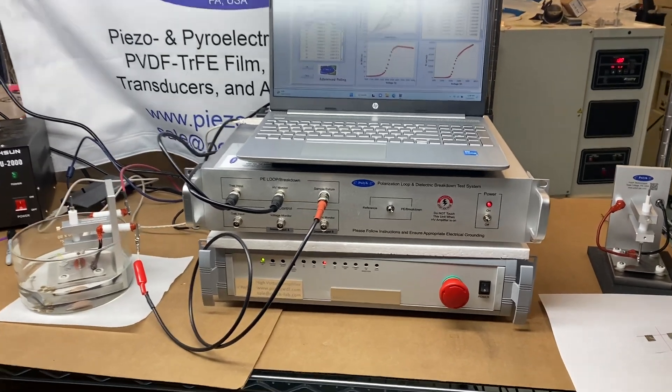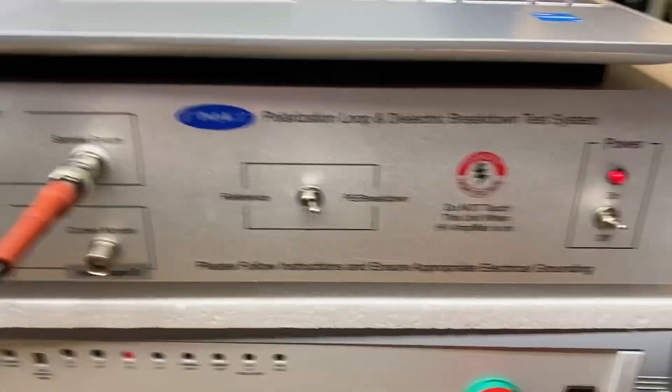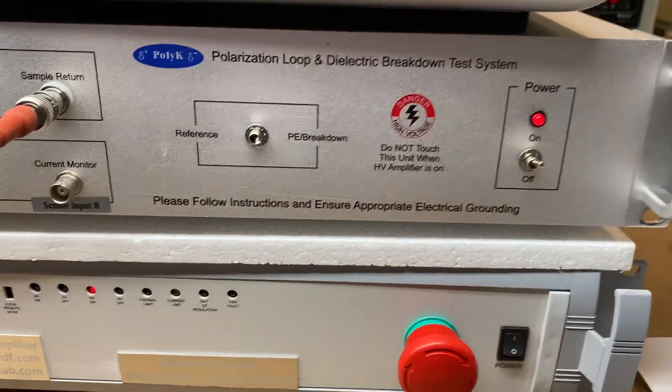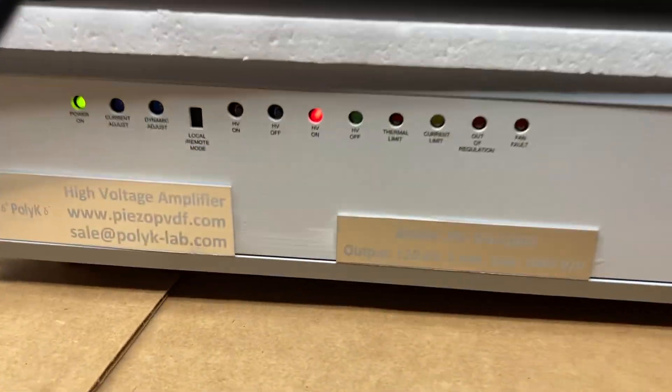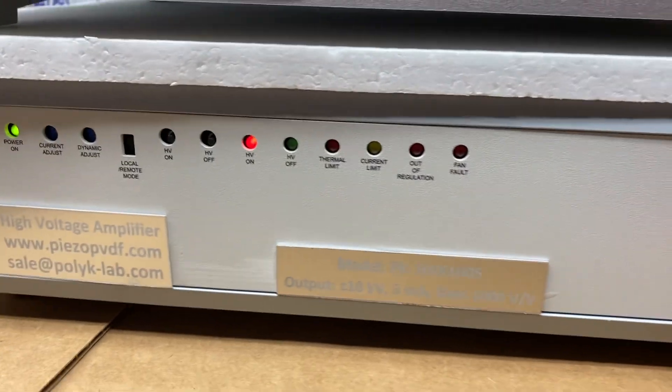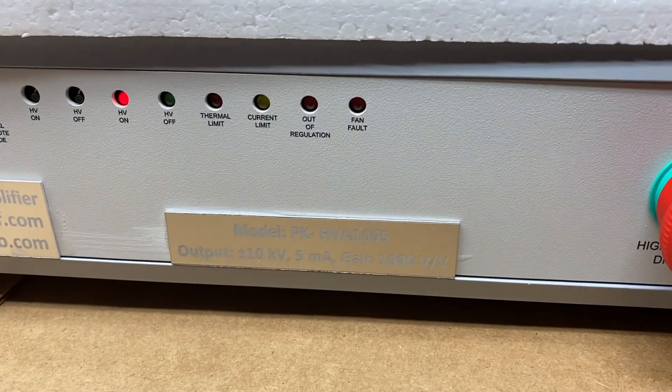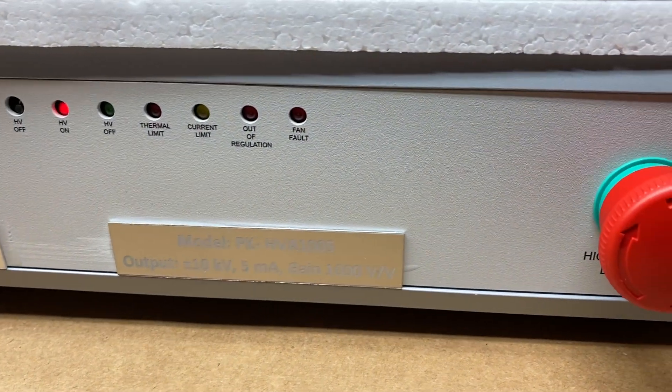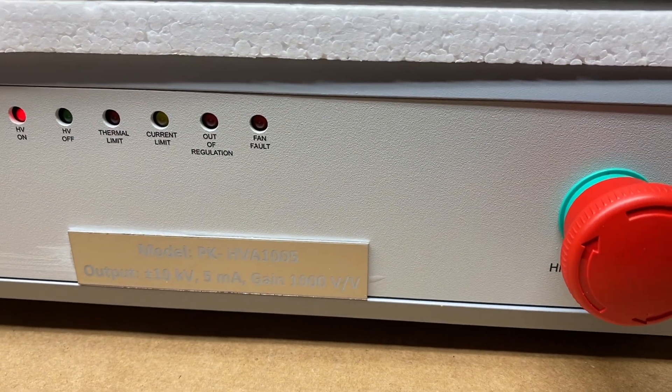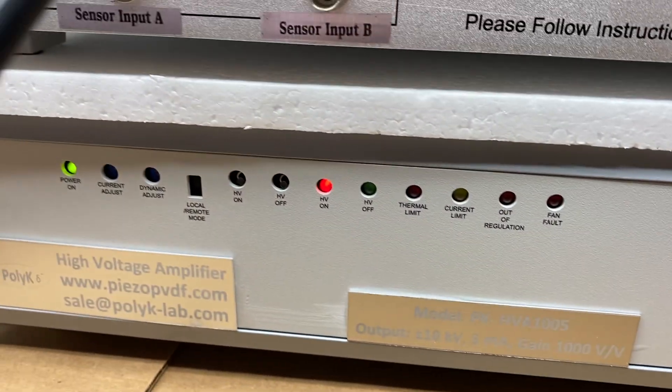In this system, you have a ferroelectric test system and also a 10 kV high voltage amplifier. This is a 10 kV 5 mA amplifier up to 1 kHz.